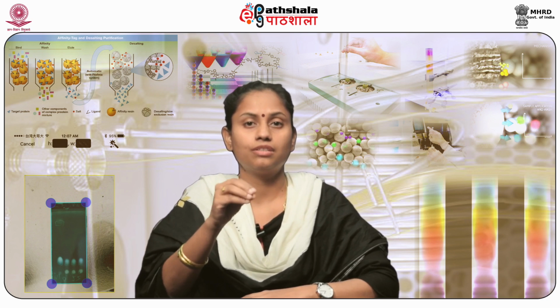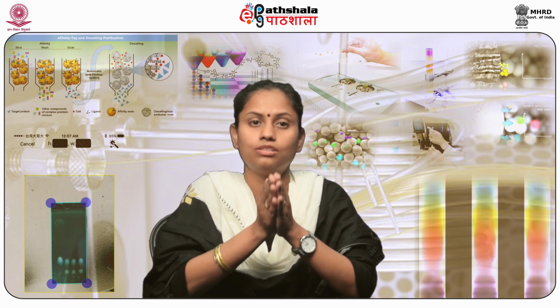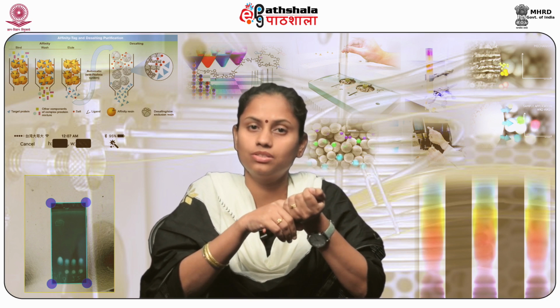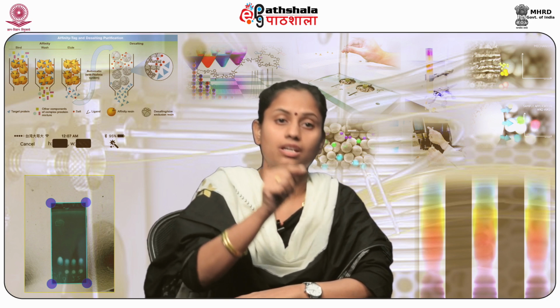Now let me familiarize you with some of the commonly used chromatographic terms which are used in various different types of chromatography. Let us first start with the stationary phase. So what is a stationary phase? This phase is usually fixed in place for carrying out the chromatographic procedure. A very simple example of a stationary phase is silica, which is used in thin layer chromatography. Another example is cellulose, which is used in paper chromatography. In this phase, the substance that is to be separated is selectively adsorbed.